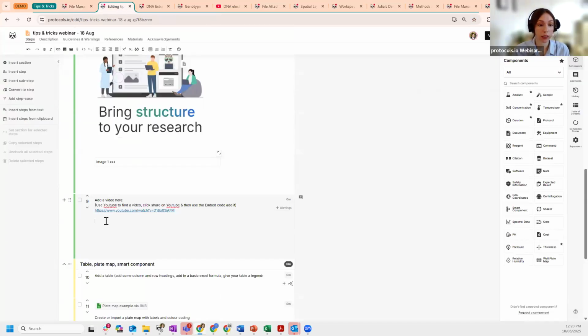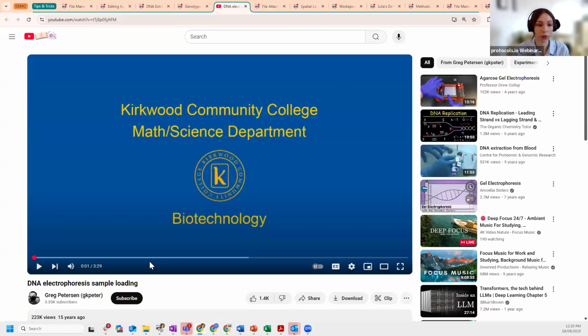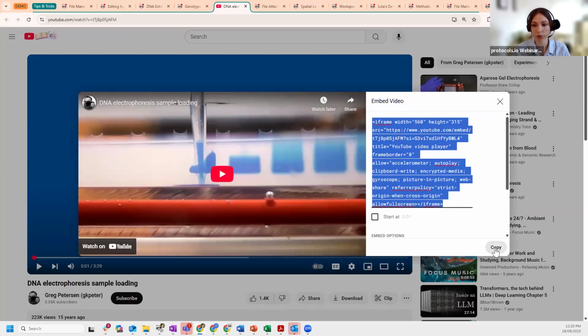So in this instance, I want to embed a YouTube video. I've already got that YouTube video open here. And so then what you would do is you go down to share and then click on embed. And then you would copy all of this.